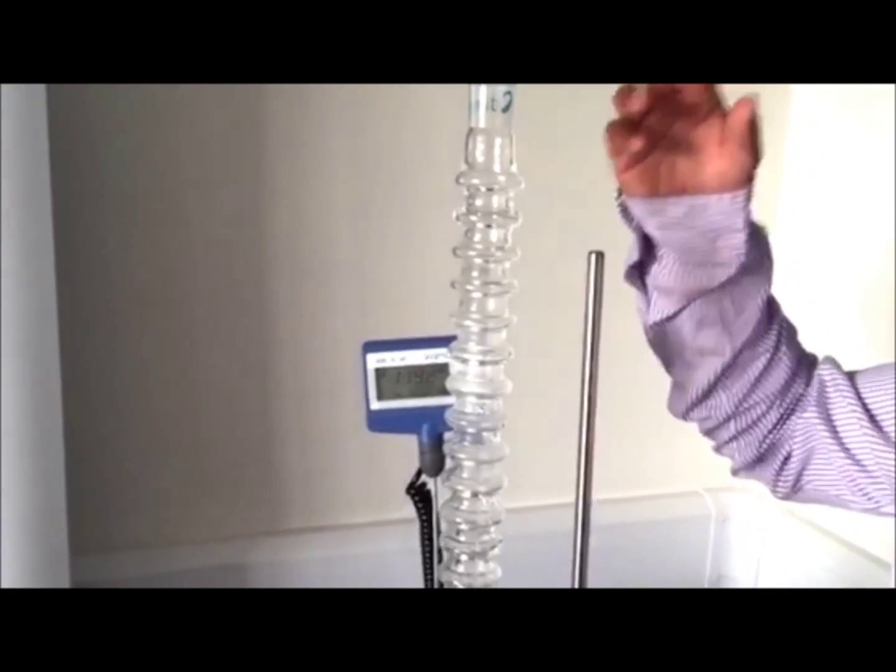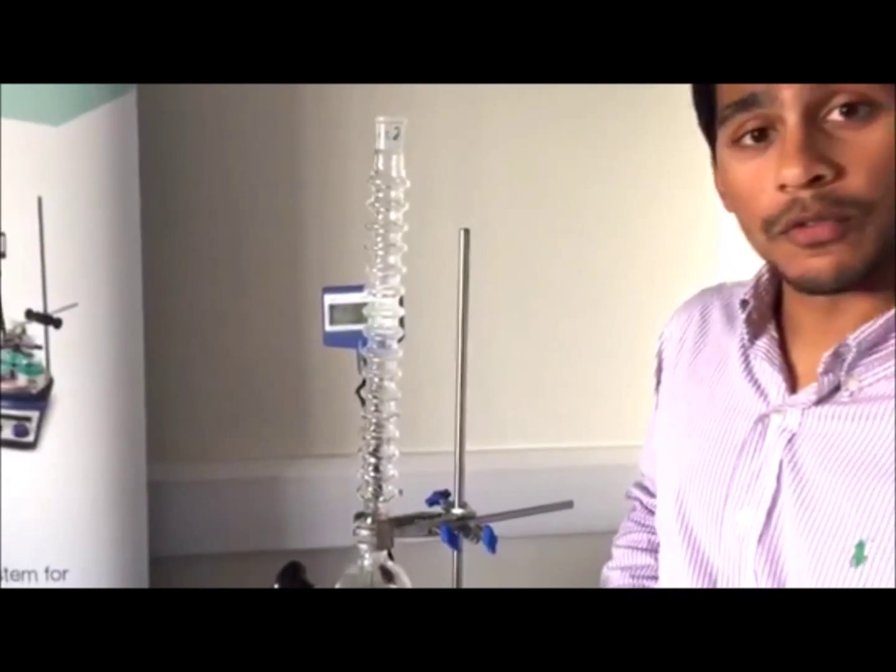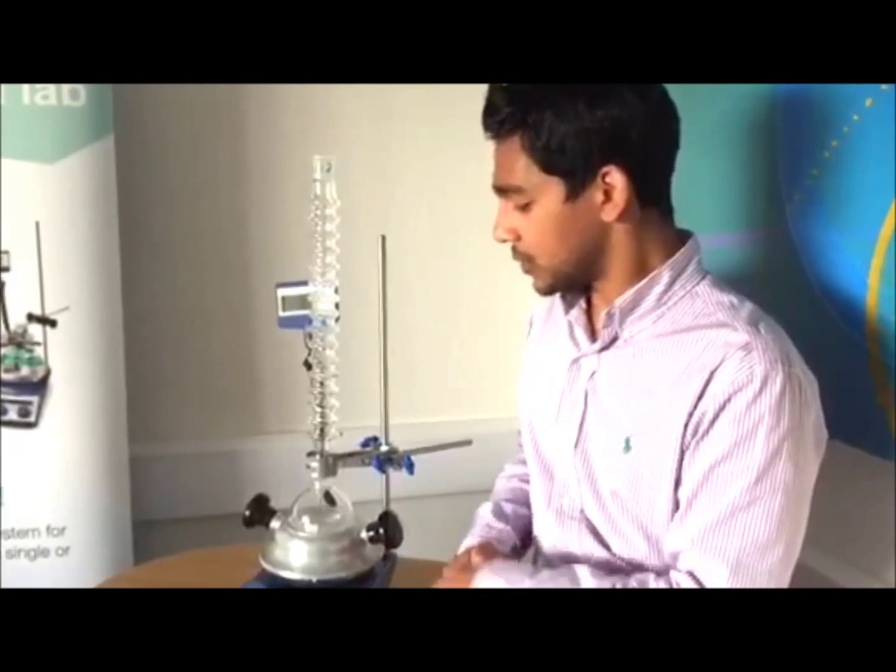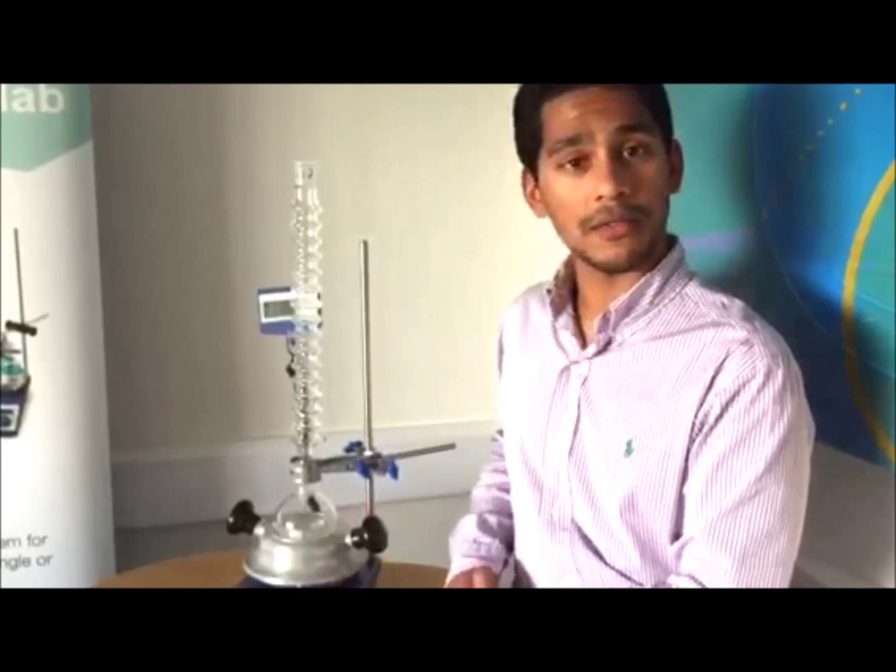We've also got a slightly taller column for more volatile solvents on larger scales. But it's this unique design which is working incredibly well at containing all the solvents in a much safer water-free environment.